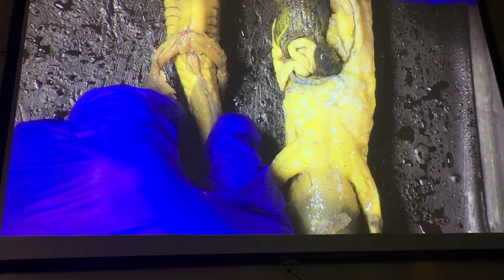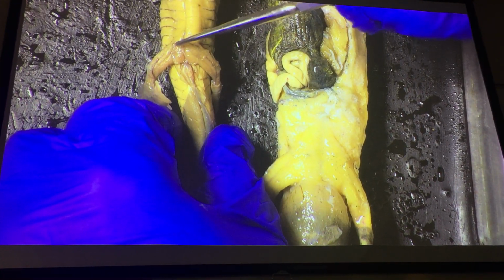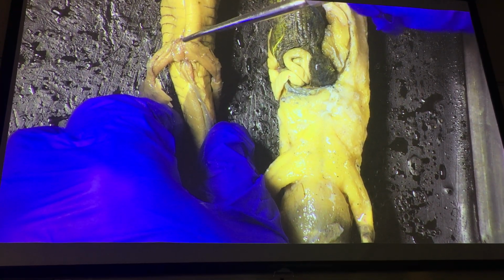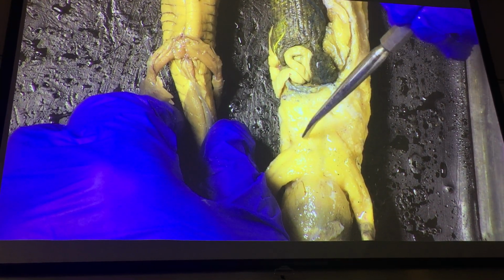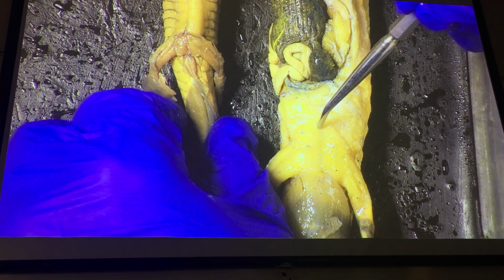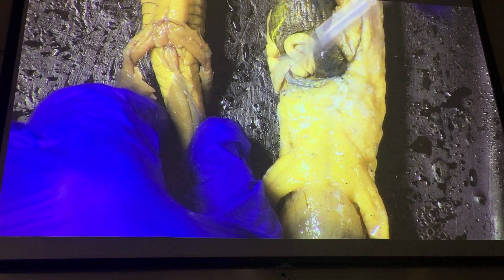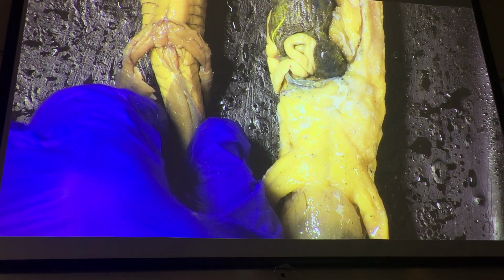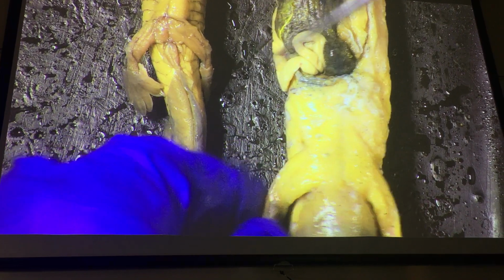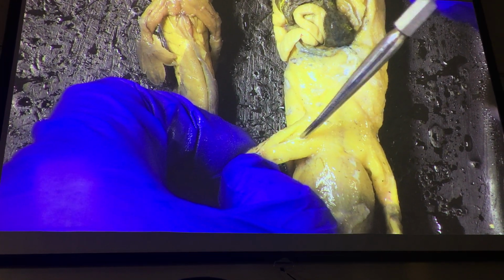That's the real big difference. And it just throws you off a little bit when you're trying to get your starting point with learning the muscles. But here's our pubo-ischiofemoralis externus. Again, the externus is the internal one, and the internus is the external one because it's named for attachment to the pubo-ischiatic plate, not relative positioning. So we stretch this out here, and here we can see pubo-ischiofemoralis internus.